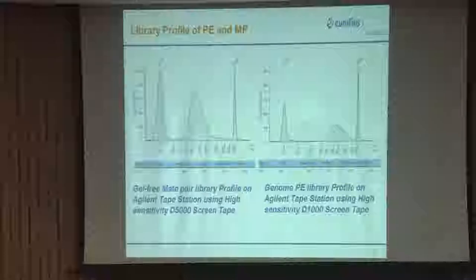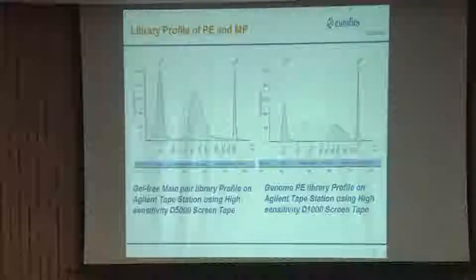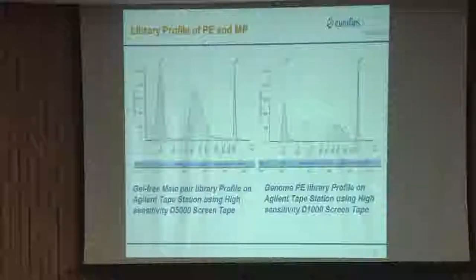It's a read length, right? Reads are the sequences. The DNA template is sequenced 150 bases two times, from the forward and from the reverse. In Sanger also we have a forward read and a reverse read. Similarly, in this also we have a forward read and a reverse read in case of paired end. So there are different libraries with different directions of reads, and these different directions make it very important for us for assembly, right, the gaps, filling and all. We'll talk about it, so I think that will get clear.